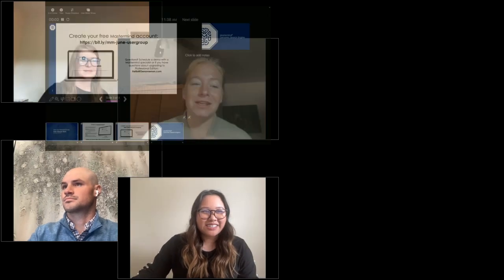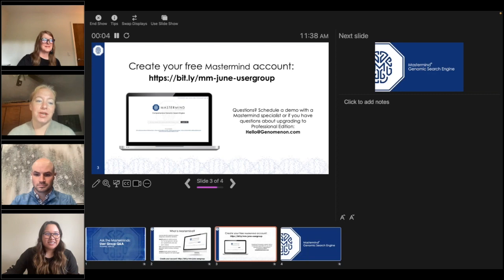If you want something more general, as Denise showed, the one time to take this into consideration also is intronic variants. Obviously, you're coming in with a cDNA, but again, you can then choose, do I want anything in that splice donor, or do I just want my one specific change? Whichever one she gave up, you can do one specific exact change.